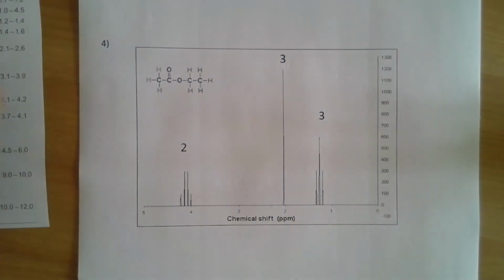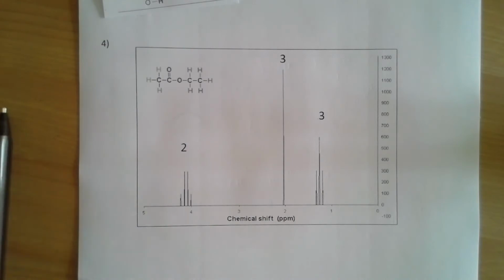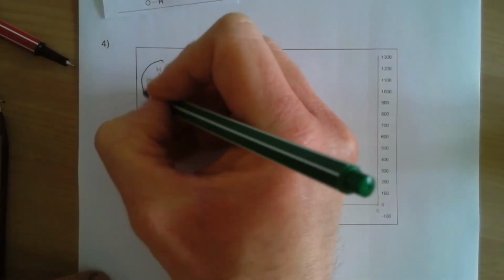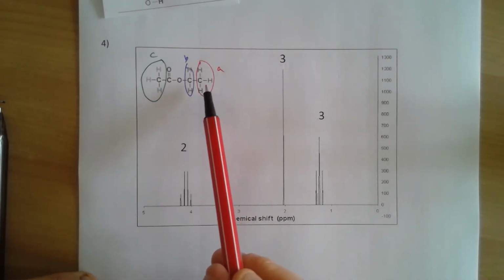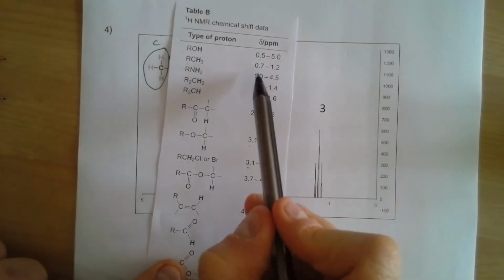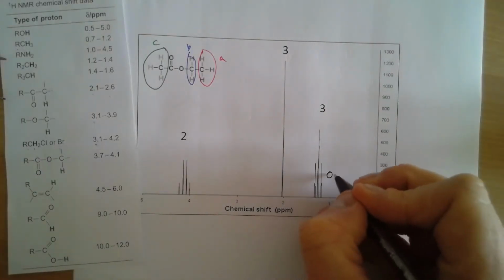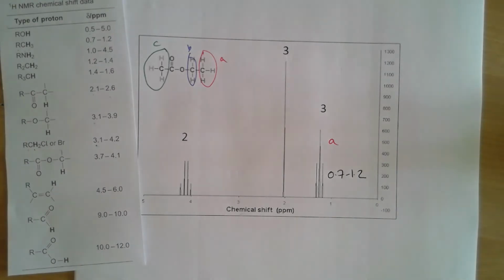Example number 4, we've got 3 hydrogen environments, environment A, B and C. So environment A is likely to be the most shielded environment, probably this environment here, because it's the furthest away from any electronegative or electron withdrawing groups. If we have a look at where we're expecting to see it, according to our data sheet, between 0.7 and 1.2, that's just about in range there, so that's probably about 1.3, so 0.7 to 1.2 there, so that's definitely environment A as a result of the chemical shift and also as a result of the integral.